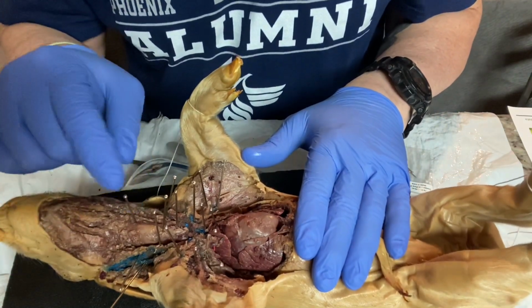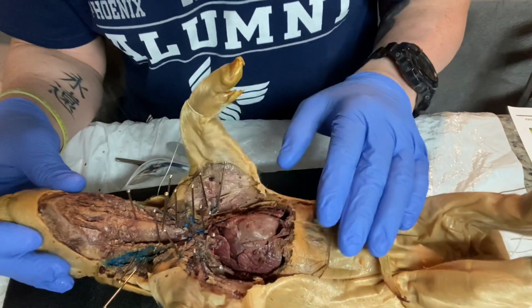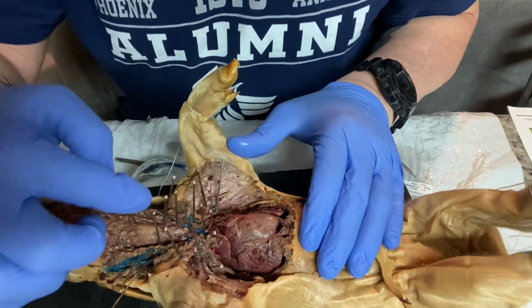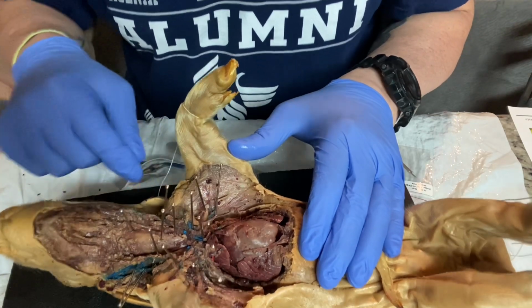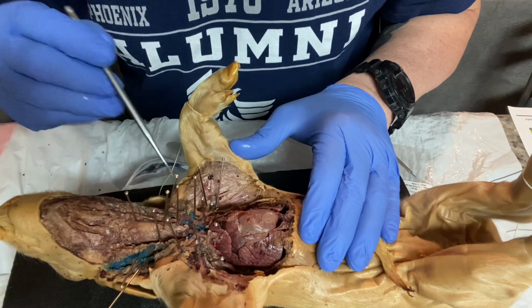Again, up over on this pin, we have the larynx, trachea, and thyroid gland. Common carotid arteries here on the right side where this pin is, and common carotid artery here on the left. And I'll use my probe here.